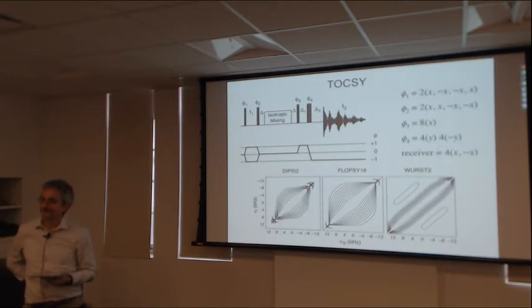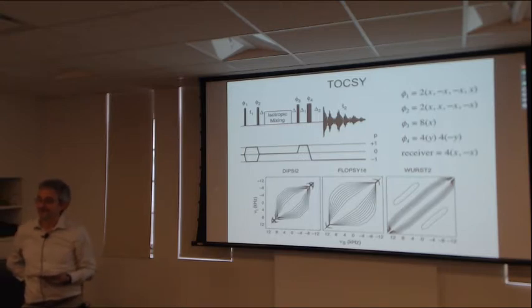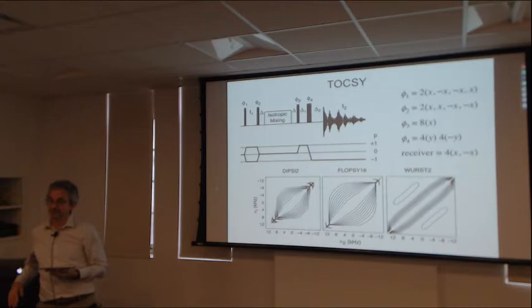What's your impression about the impact for biopolymers, where relaxation is a big part of our challenge? The application may be more in the small molecules, or is there that big impact?